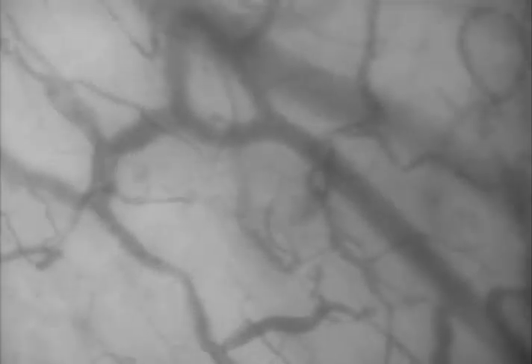On the left, there is a junction of vessels with various types of flow. This could be pressure, but since flow all around the vessel is continuous, we cannot say that the slow flow we see in the junction is definitely caused by pressure. We would score this a 1.